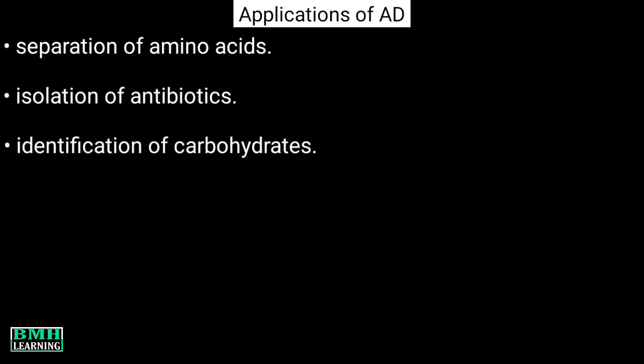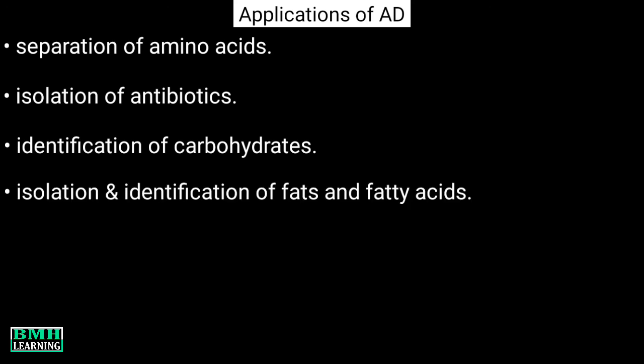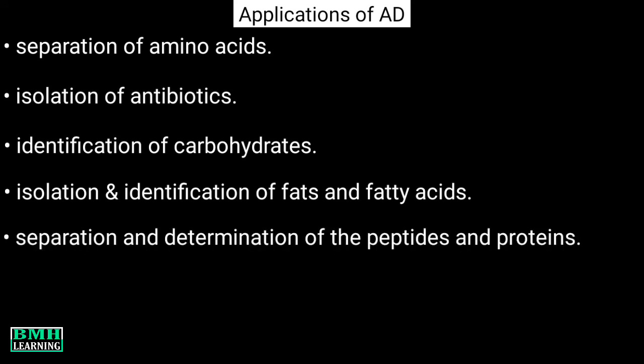Adsorption chromatography applications. It's used for the separation of amino acids. It is useful in the isolation of antibiotics. It's also used in the identification of carbohydrates. It is very helpful in the isolation and identification of fats and fatty acids. It is used in separation and determination of peptides and proteins.